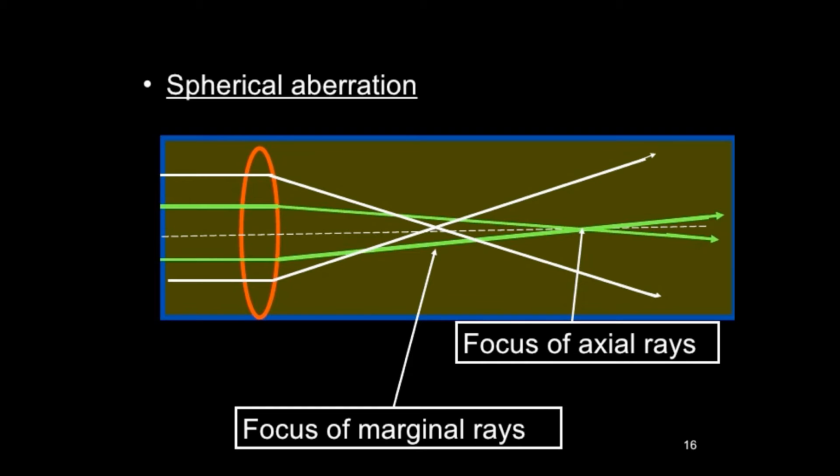It's because of the spherical aberration that the useful aperture of the lenses is tiny. It's absolutely tiny. It's in the order of 10 to the minus 2. When you go further out in a lens, the rays go closer and closer here, and you get a very big disc. So the aperture limits the rays to the useful area here, and that is the reason why electron microscopes don't have a resolution that corresponds to the wavelength.